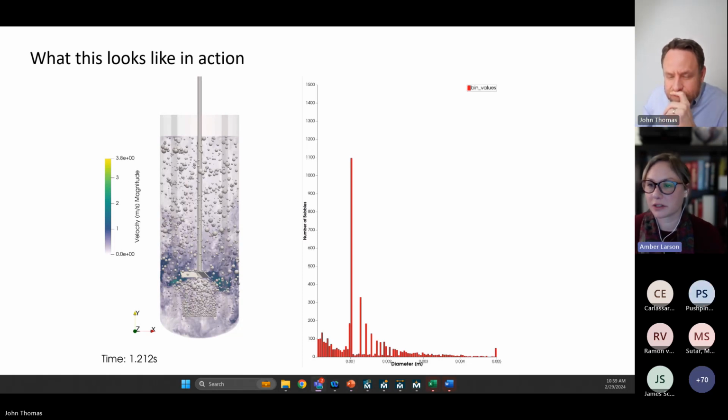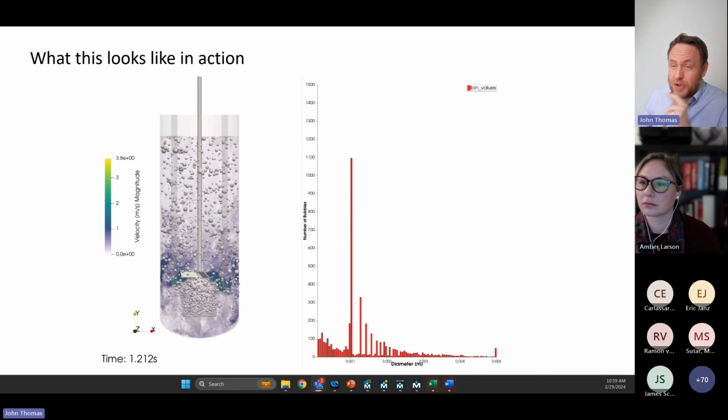Could I apply your methods to solid particles that can either break up or coalesce? Sure, but solid particles break up in very different ways. There is good theory for predicting how bubbles break up. For solid particles, whether it be dissolution, which is well understood, or other sorts of breakup events, typically we're modeling processes wherein the fluid EDR causes a bubble to break up. Particle breakup is typically more of a mechanical process, wherein a particle hits a wall or hits a mill as where it's breaking up. Now we can do that, but it'd be a different family of breakup models than we're showing here, which is a fluid mechanical based breakup process. Okay, a few more questions.